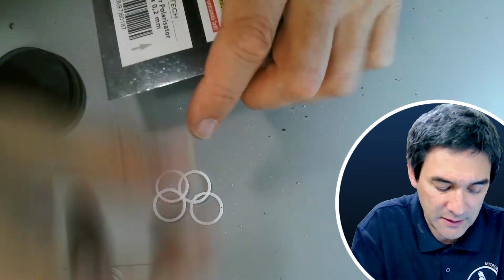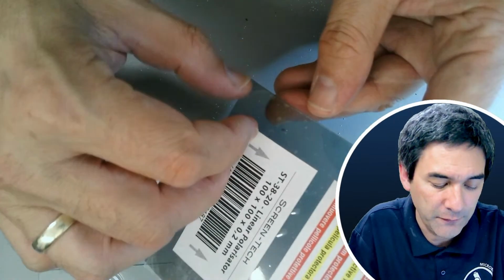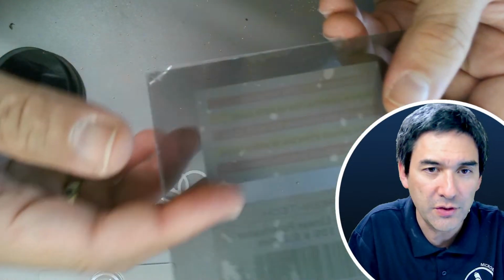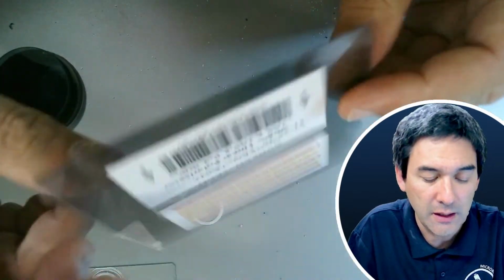What I recommend is that you buy yourself so-called linear polarizing filters. I got this from Amazon. There is a protective film on here which I did not remove yet. You can cut them into shape if you want to. Essentially they're quite cheap, very versatile, and also very thin.